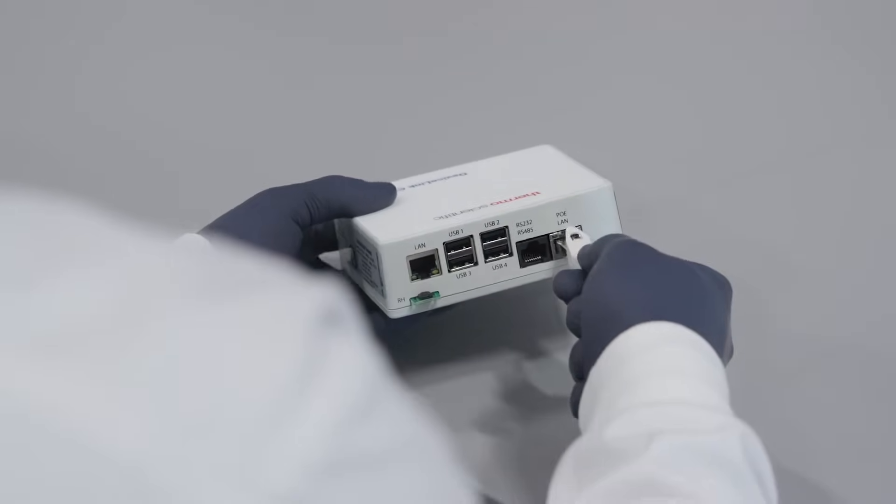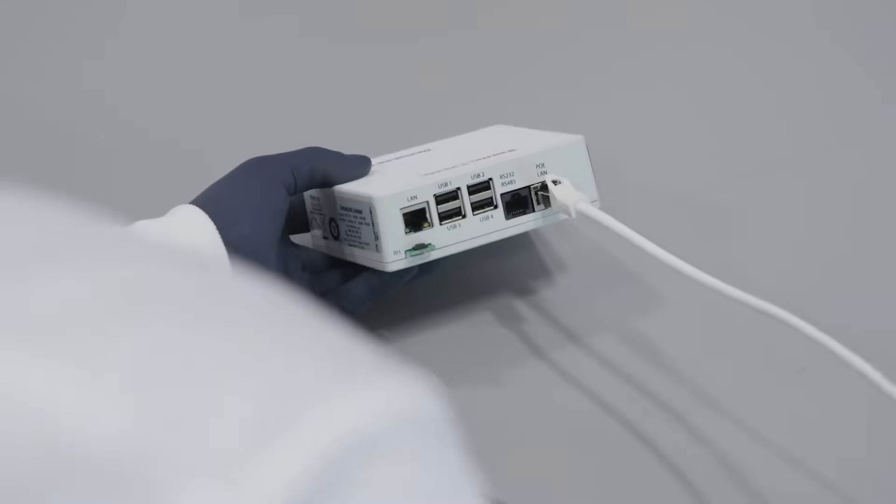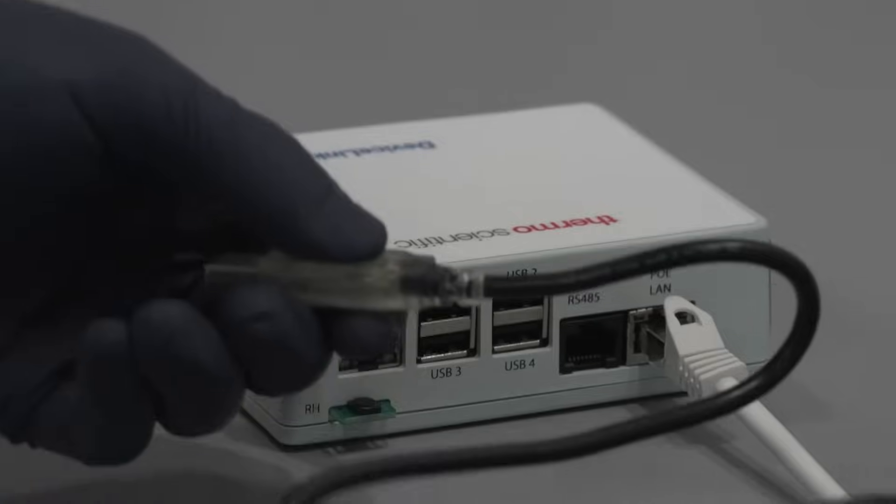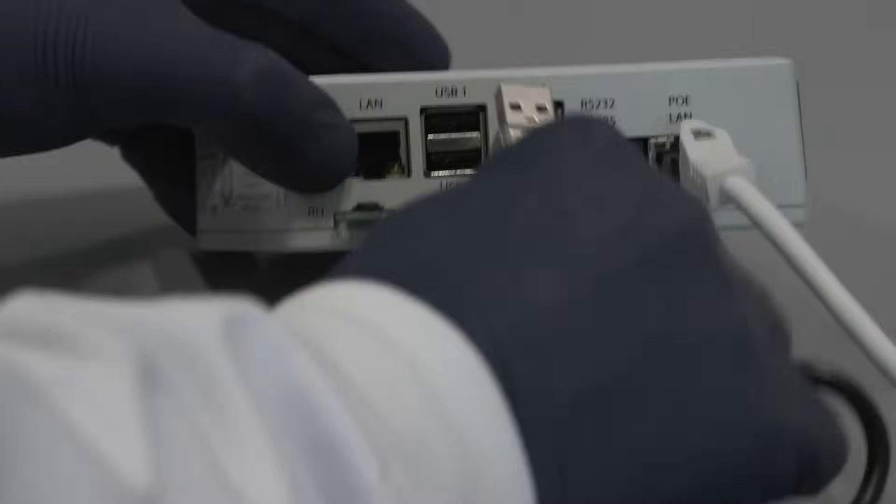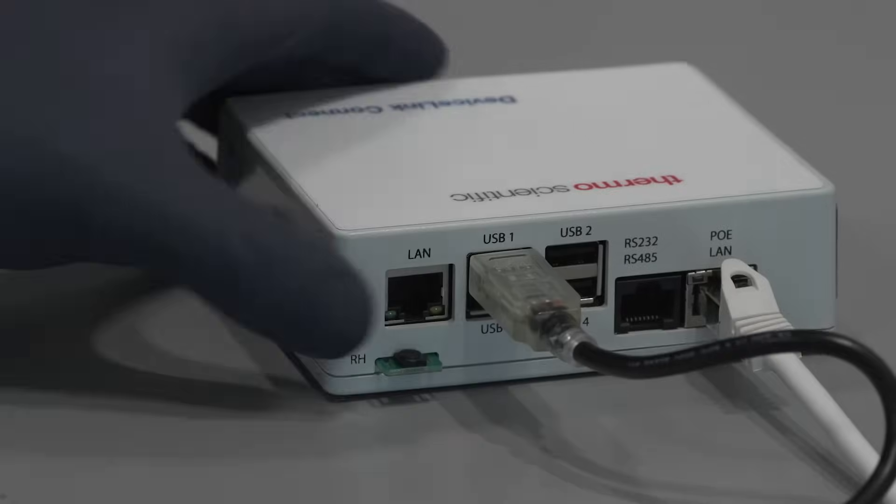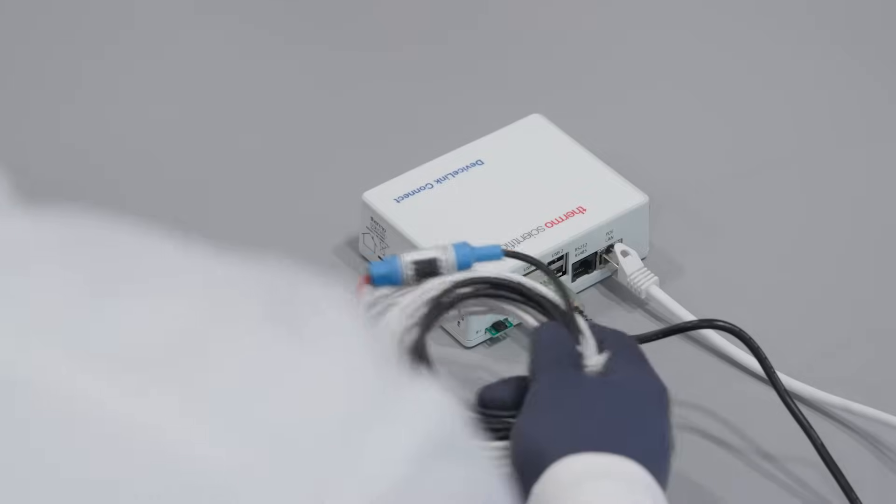PoE is a great alternative to main facility power because facilities networks often operate on a different power system than the main electrical lines. If there is a power outage, PoE may continue to provide power to the monitoring system.